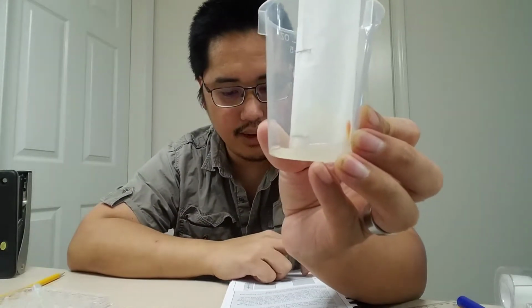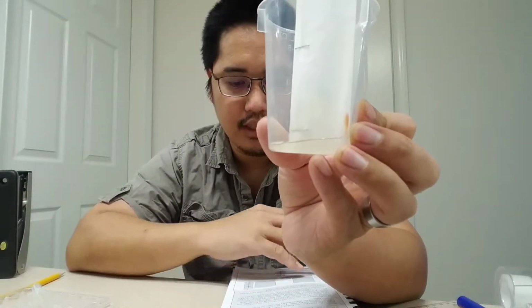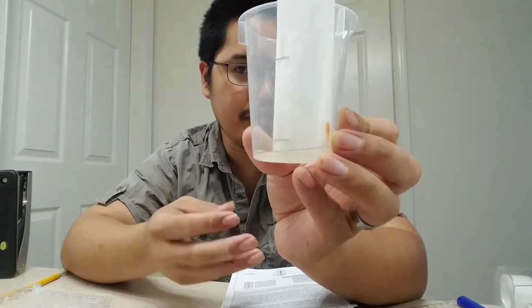And what we're going to have to do is, this thing will take about 30 minutes. So that thing's going to go all the way up. So we're going to set that aside and wait 30 minutes. Although I'm not going to wait the full 30 minutes because, again, this is just the experiment. But I'm going to tell you what's happening here.